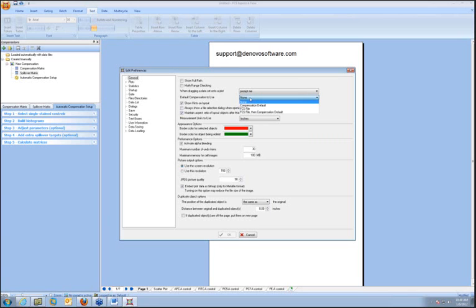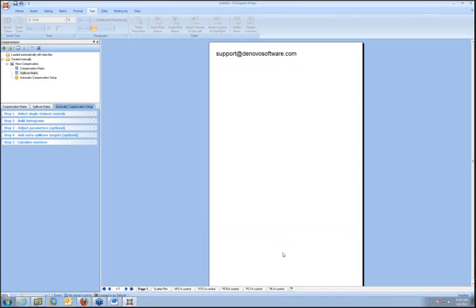We had a question about why do compensation during analysis time. This particular person has only seen people do compensation during acquisition. There's a lot of reasons for that. Depending on what instrument you have, if you do compensation during acquisition, then the compensation is saved with the data. The data is directly altered so that the compensation is stored with it. And if the compensation is wrong, there's no way to correct for it. You can't get back to the original data with the mistake.